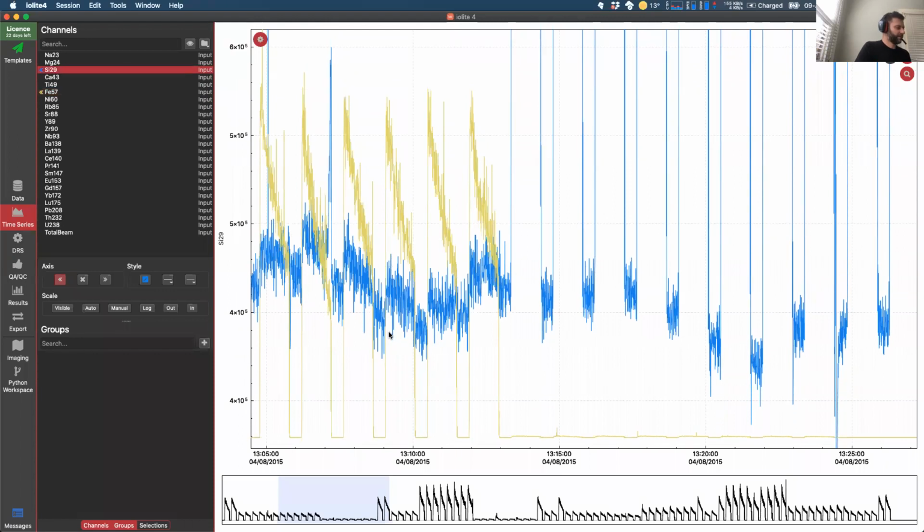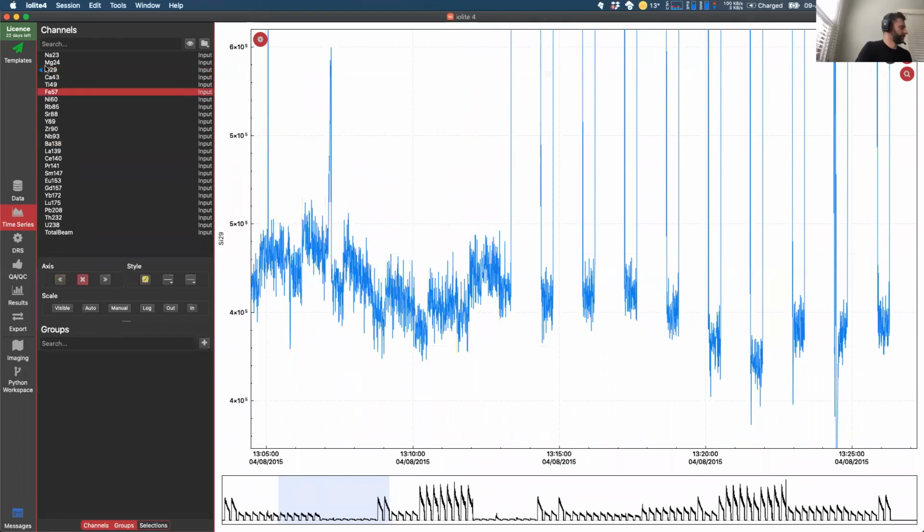And if nothing's moving at all, or if you can't see your selections, it's because you haven't selected a channel up here. So if I was to select a channel that's not shown, then I won't see any selections. So make sure you have the channel that you're interested in selected up here. This will probably be something that you'll come across later on.